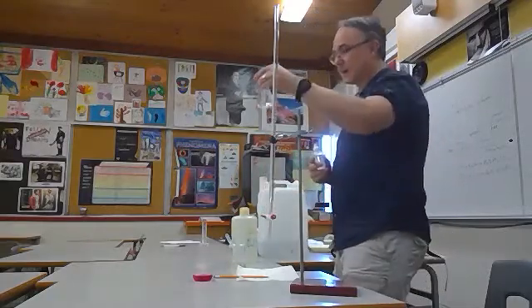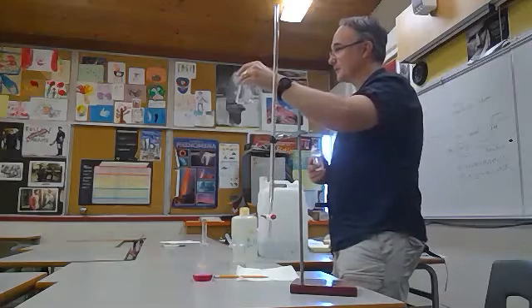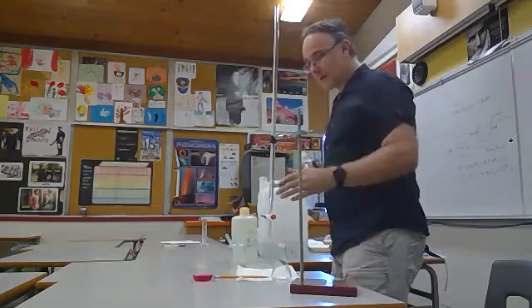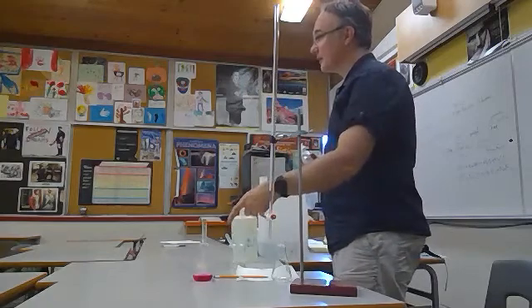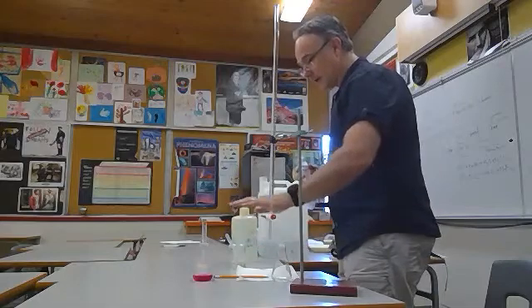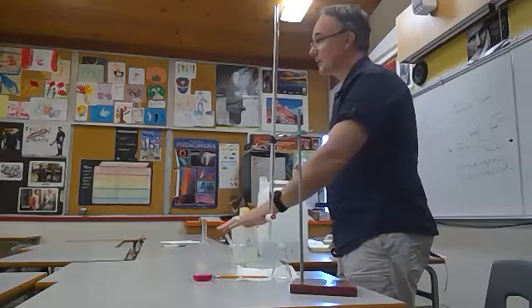Once again, I can't tell anything. It looks exactly the same as it did before. But if I add enough base to it, it eventually will turn pink. So basically, I did this before you came. I had the acid here, but then I added a certain amount of base to it.